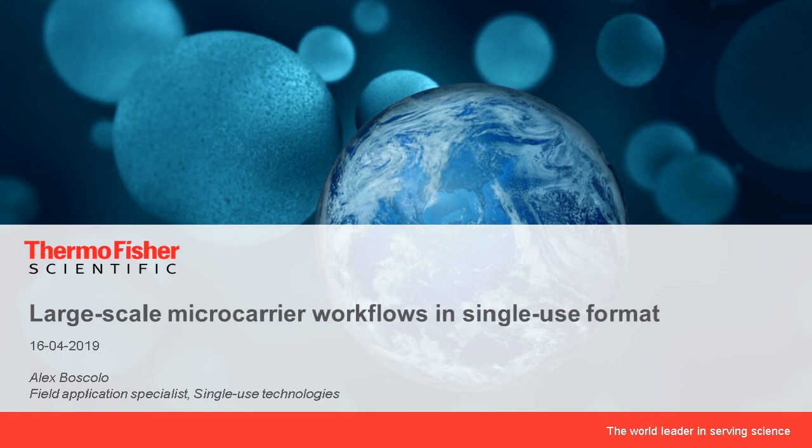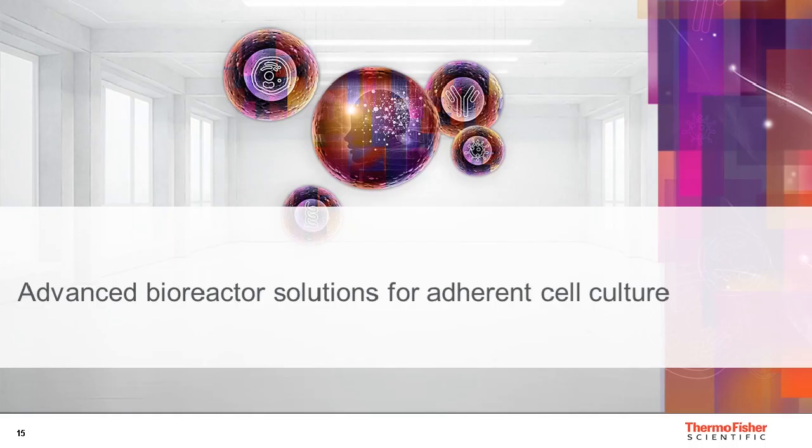And yeah, we will spend the next 15 minutes talking about really our approach when it comes to scaling up adherent cell culture. Obviously, when it comes to adherent cell culture, we had a glimpse of it in the past 5 minutes with Jeff. But one of the main challenges with adherent cells is really the scaling up of the processes. As long as you are working at lab scale, cell factories, they work perfectly, and roll bottles are also excellent. But scaling up, it's really challenging for multiple reasons.